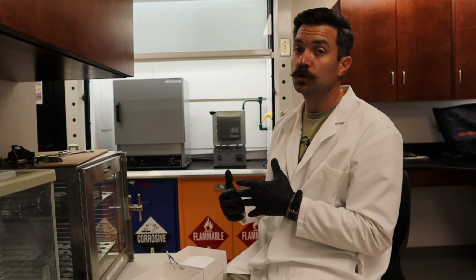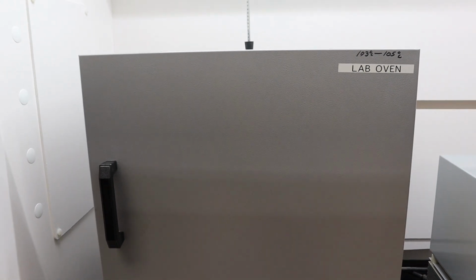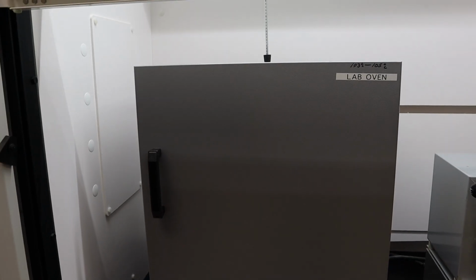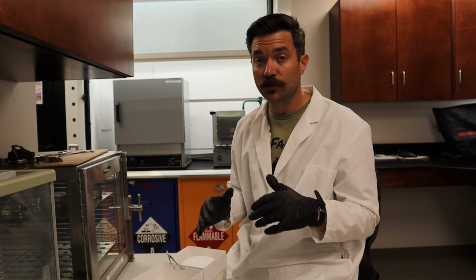But your lab oven, you're not actually cooking in that oven. The lab oven is meant to dry out the sample because the weight of the sample is going to be heavily increased when wet, right? So the lab oven's purpose is to dry out the sample. For this test, you want to leave that sample in the oven for 1 hour. You can leave it in longer if you do, but minimum 1 hour so that the sample totally dries.